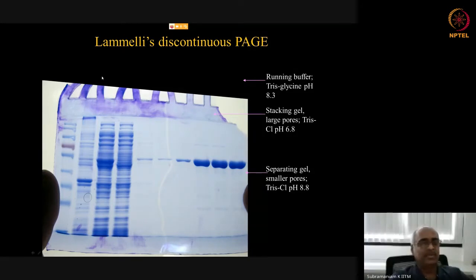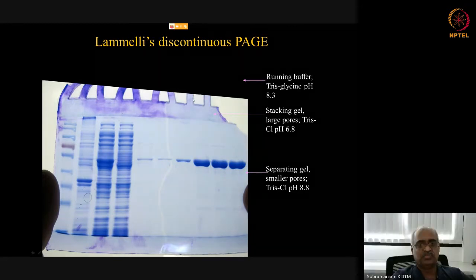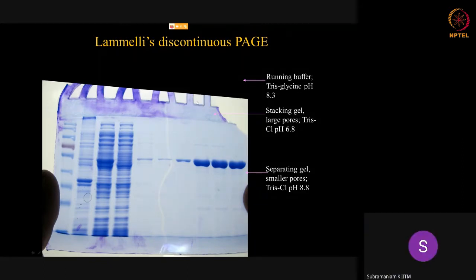So this is going to be a long comb-like structure. You can see here, it extends some more. It's usually about a 1 to 2 centimeter deep well. So now when you add liquid, let us take this one, this is a uniform shape. Suppose the liquid fills this much, and when it is homogeneous, the same protein molecule will be present here, here, here, everywhere up to the top. So you have a column whose height is about 1 centimeter, let us say.